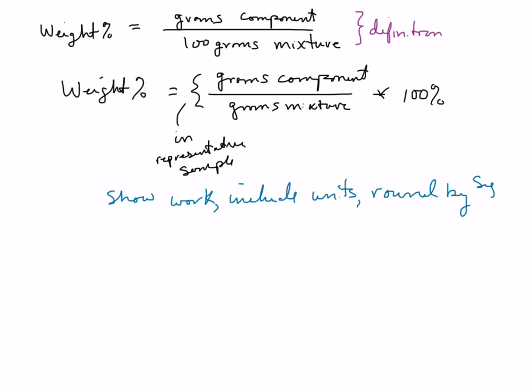If you're all about that, then what you're going to do is measure the mass of the mixture, which is the whole egg, nothing but the egg. So you're going to weigh the whole mass of the mixture, grams of mixture. And then you're going to separate it out and measure each of the masses of the components. Now, of course, ideally, the masses of your components add up to the mass of your mixture. It doesn't necessarily work that way.